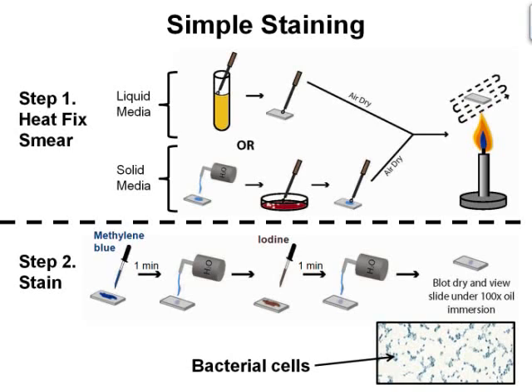Pick up the slide by one end and hold it at an angle over the staining tray. Using the distilled water wash bottle, gently wash off the excess methylene blue from the slide by directing a gentle stream of water over the surface of the slide. Wash off any stain that got on the bottom of the slide as well.